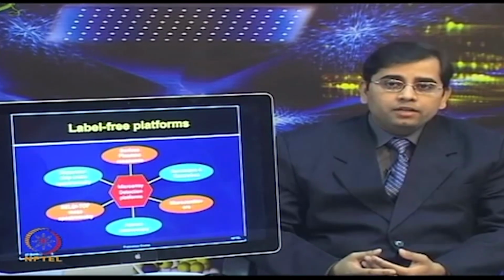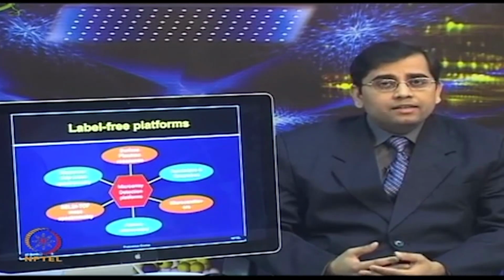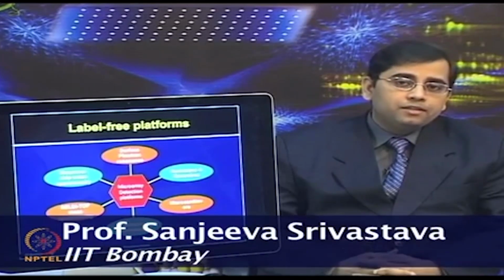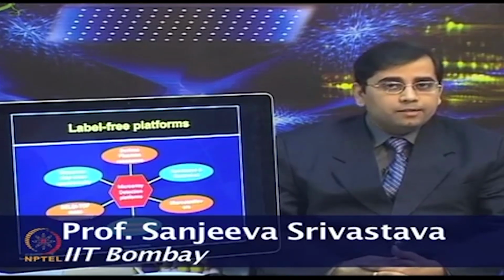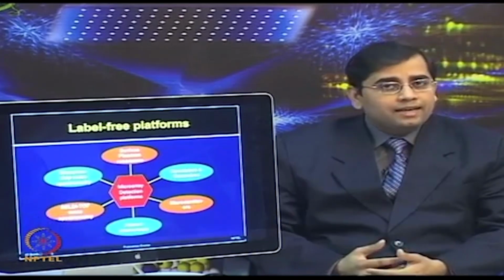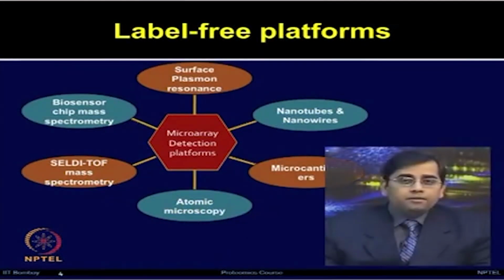The tags could be fluorescent dyes or radio labels, whereas the label free systems try to avoid any labels in the query molecules. They depend on the inherent properties of the query, its mass, dielectric properties, the optical properties, etc.